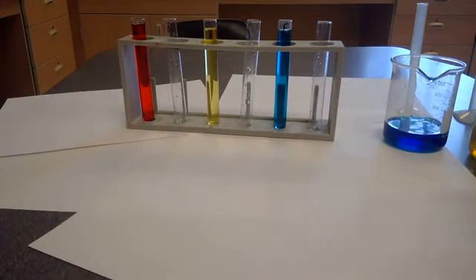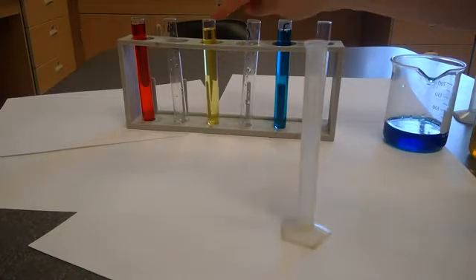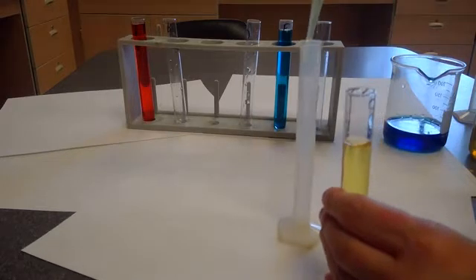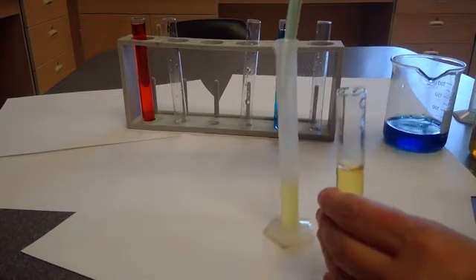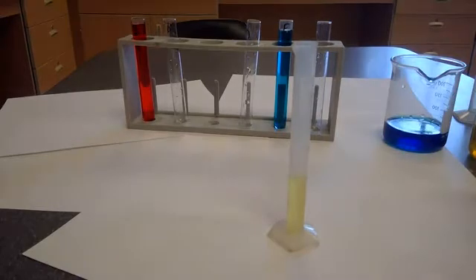Step 6 says that I'm going to take from test tube C, and I need to take out 4 milliliters. So test tube C right here, I'm going to take out 4 milliliters. I think I'll use the small one for that. And I'm going to pour those 4 milliliters into test tube D. So I'm going to move 4 milliliters from here into here. The extra I've got to make sure I put back into here. And I've got to make sure that my reading is accurate.